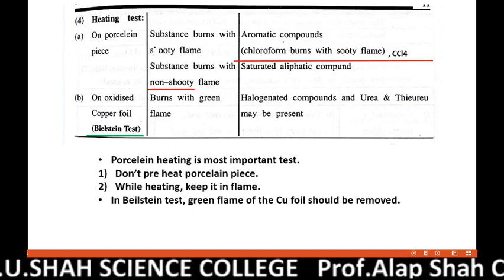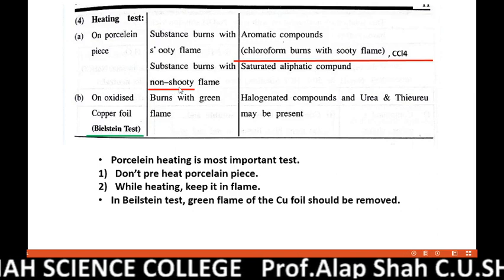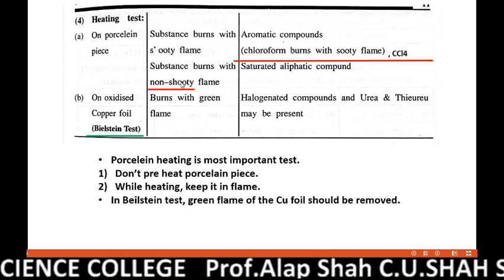And mind well, in your book this spelling is wrong. It's not shooty, this is the correct spelling. It's a sooty flame, not a shooty flame.